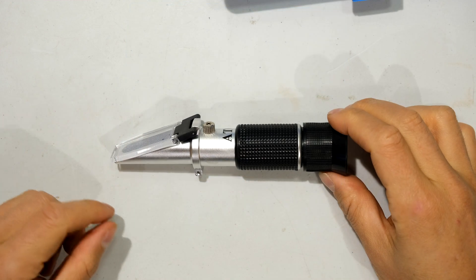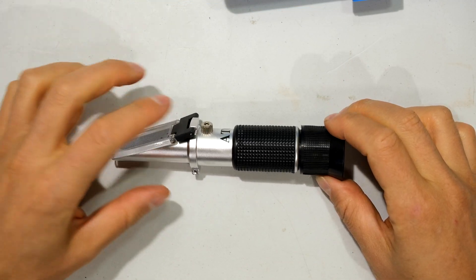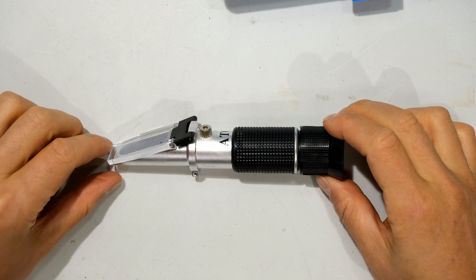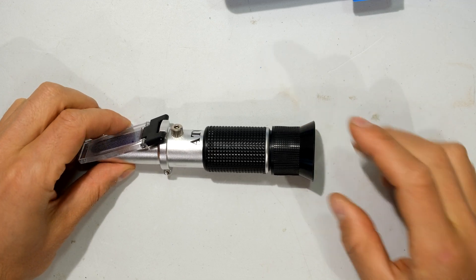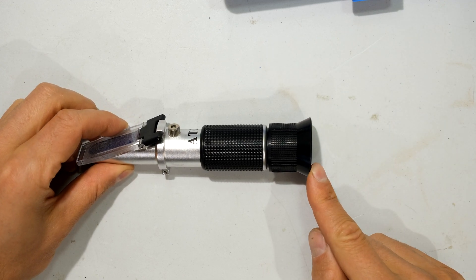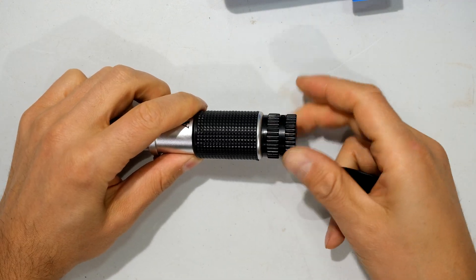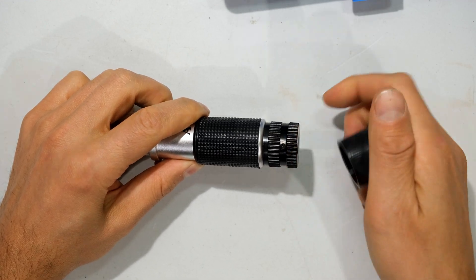To name the parts: this is the prism, this is the daylight plate, and this is the calibration screw. If you'd like to see step-by-step how to calibrate your portable refractometer, please check out my YouTube channel. Here is the viewfinder or eyepiece, and there is a focus adjustment — you can focus it just by turning this knob.